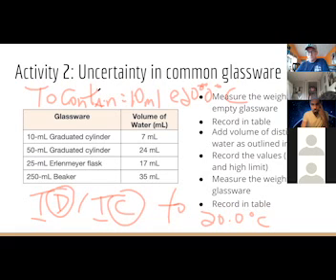How do you measure 17 ml on the flask again? Do you measure on something else? No, you use the flask. The whole point is you're going to do a pretty crappy job of estimating 17 mils. Don't worry if you do your measurements and you go, oh my God, that's nowhere close to 17 mils. That's the point.